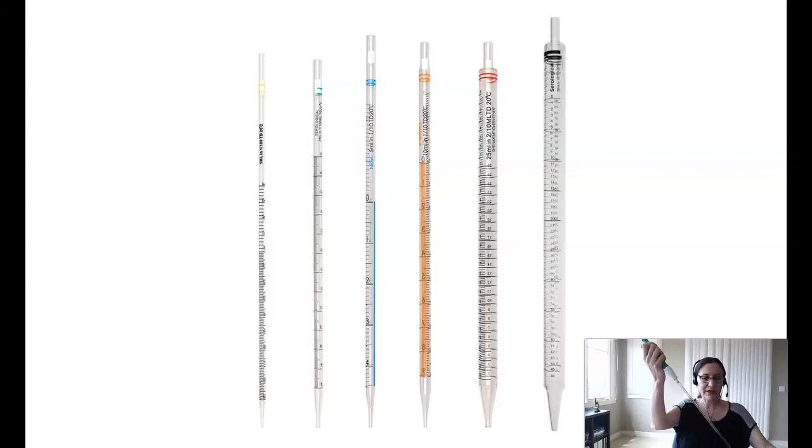Okay. So at this point, the tip would be presumably contaminated if you were working and transferring microorganisms. We would always dispose of these pipette tips down into a disinfectant solution in the lab.